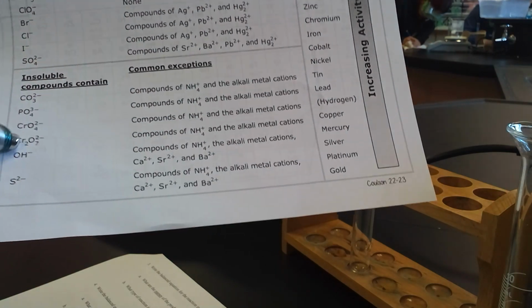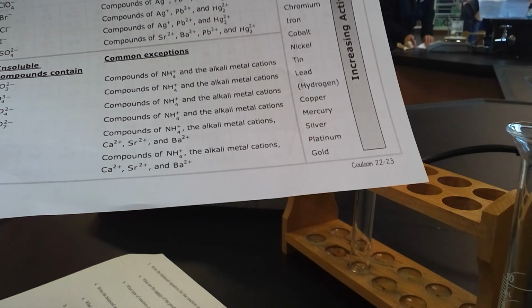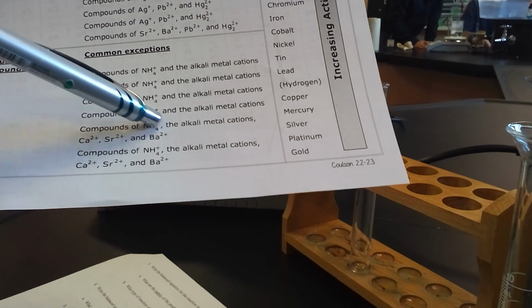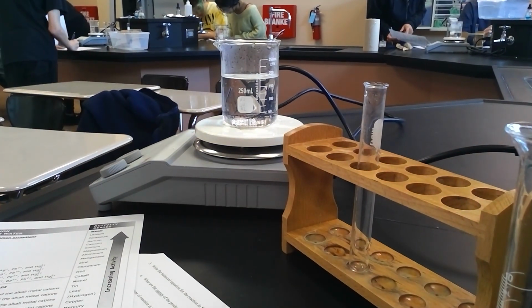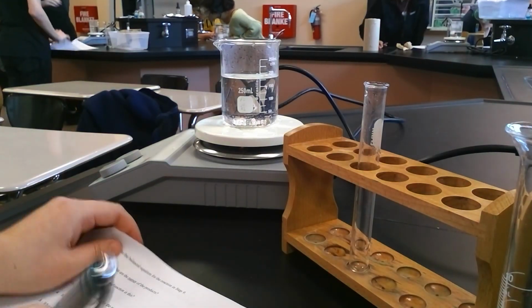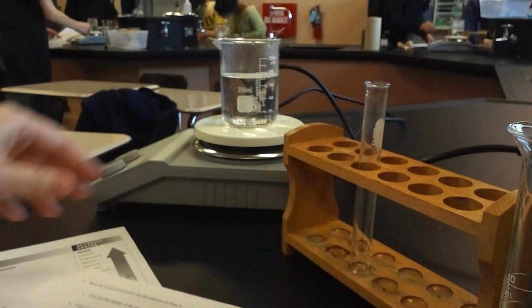But just to make sure, I'm going to take a look at the exceptions. Remember that your exceptions will just do the opposite of whatever the normal section says. So hydroxide bonded to ammonia or an alkali metal cation is actually going to be soluble, but that's not what we have in this case. We have Cu(OH)2. So it is copper bonded to hydroxide, and that is insoluble. Next to that product, I'm going to write S for solid, which means that is the precipitate that is forming.